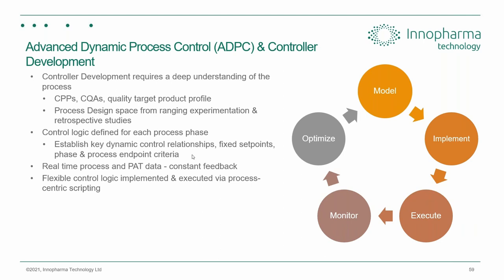Yes, great. Our head of engineering, Chris, has just pointed out that he'll cover a lot of this in depth at the next demonstration in the process lab, in our oral solid dose manufacturing process lab as well. So there are specific implementations with other PAT, with our particle sizer and with our near infrared instrument. And he'll discuss how we've implemented that for SmartX.